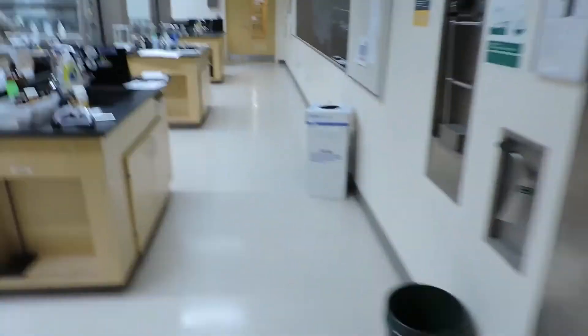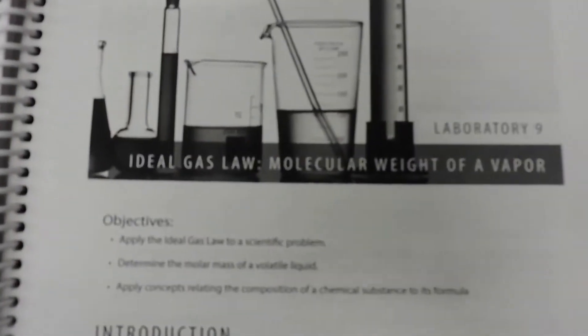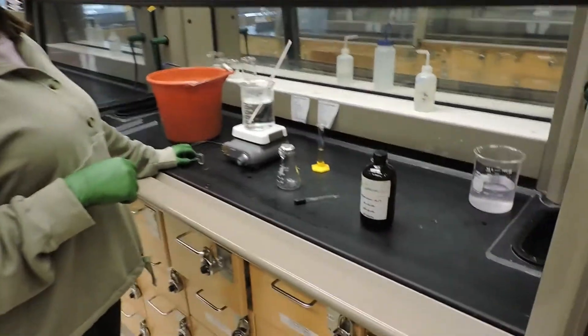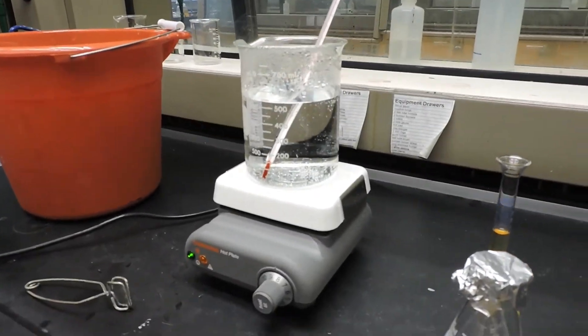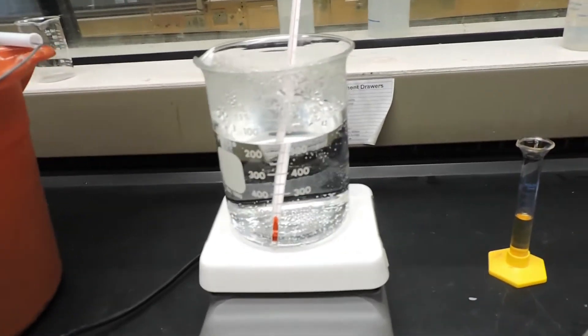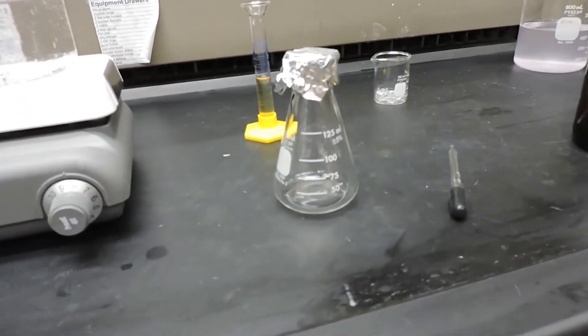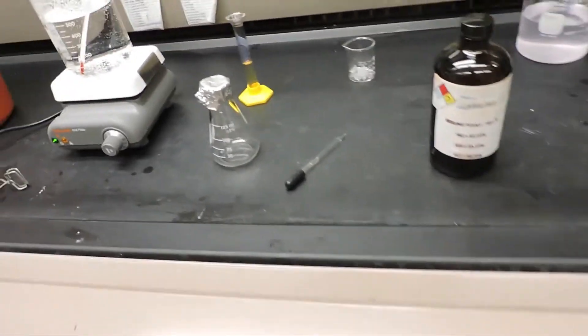Alright, and we have another glorious day in lab. Today we're going to be doing the ideal gas law molecular weight of a vapor, also known as the modified Dumas method for molar mass determination. Here we have a large beaker with right around 550 milliliters of water heated up to approximately 90 degrees Celsius. We also have a 125 mL Erlenmeyer flask covered with a square piece of aluminum foil.